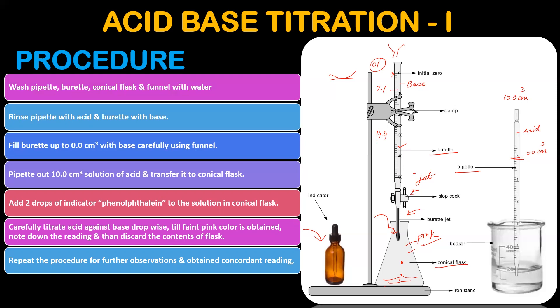You have to discard the conical flask contents, wash the conical flask, then fill it again and repeat. For example, the third reading might be 21.5.